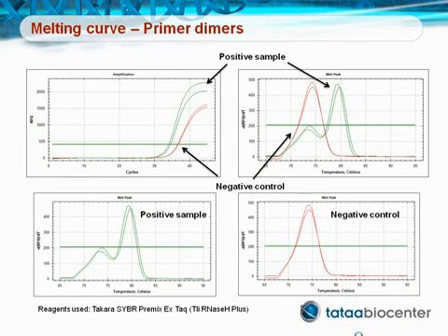We do not recommend using a Cq value from such a curve for quantification. The assay is not sensitive enough to manage this low concentration of target DNA, as this obviously is. It is important to remember that the primer dimer problem also exists when running probe-based qPCR assays. With probe-based assays, the primer dimers will not be detected by the probe, but they may still interfere with the amplification and affect the results.